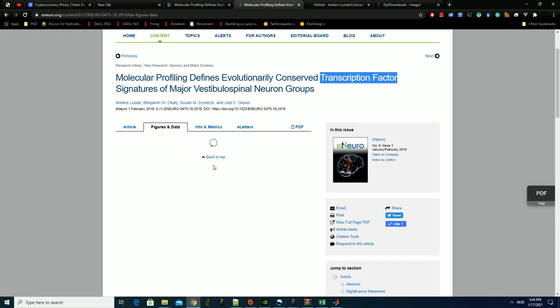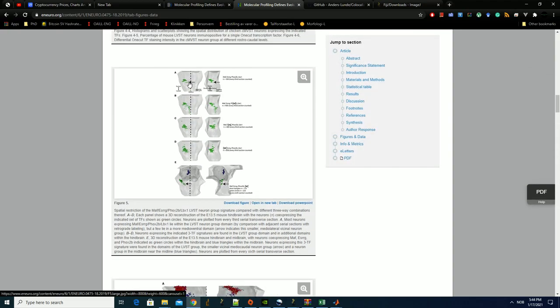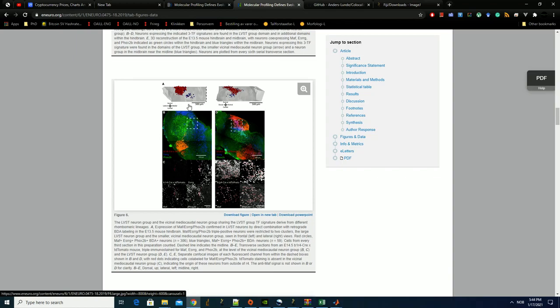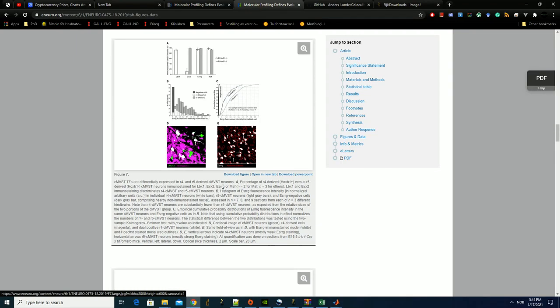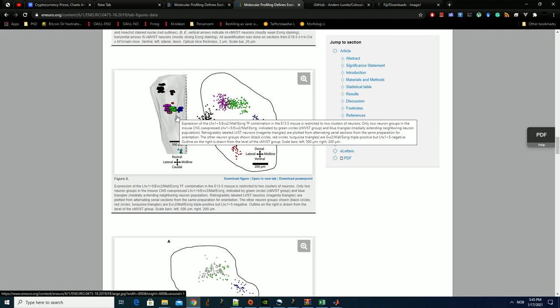So just so you can see an example of what kind of figures you can create with this tool. Here you see the brainstem with some cells. Here you see different categories, similar idea. Here you see the brainstem again with many different categories of cells and their distribution in 3D. So this is of course recreated from many individual images, where we have drawn the outlines on each image and quantified the colocalization categories.